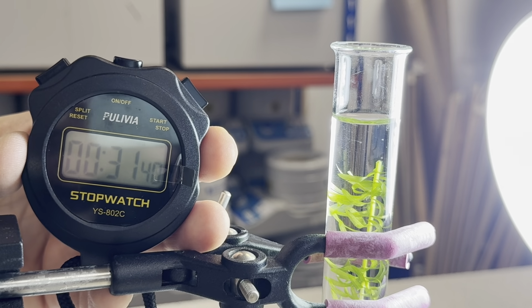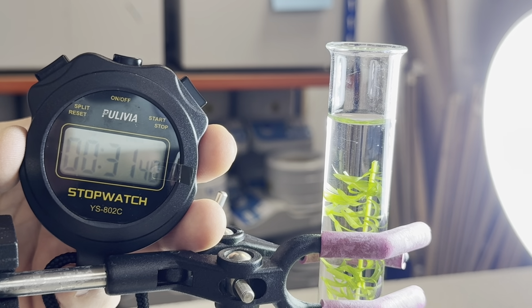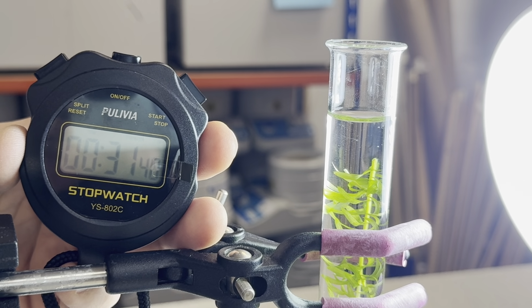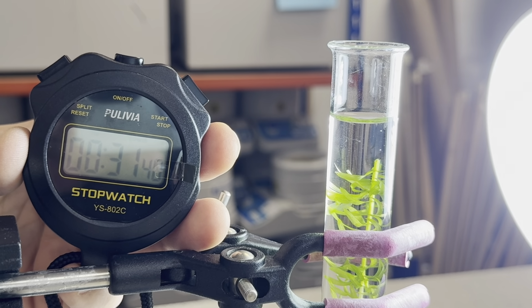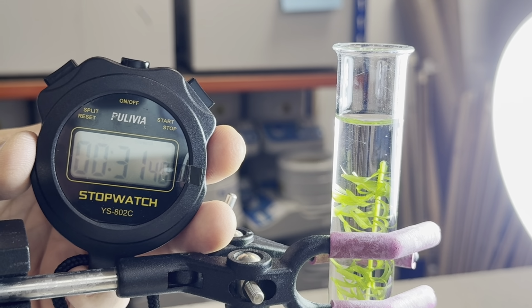Okay, so after 30 seconds, I had 103 bubbles, okay? So if the question is in minutes, I can just multiply by 2. If the question is in seconds, I can just divide it by 30, okay?